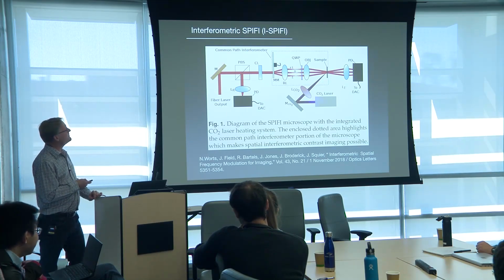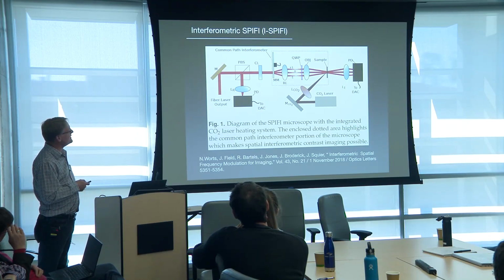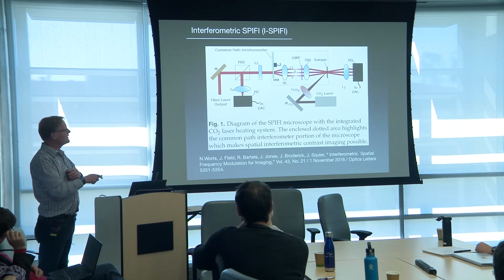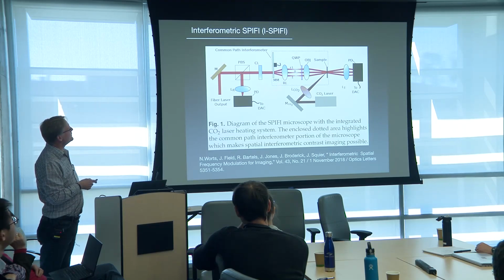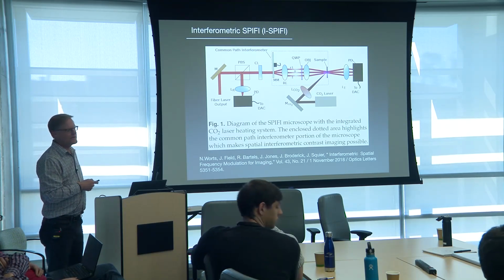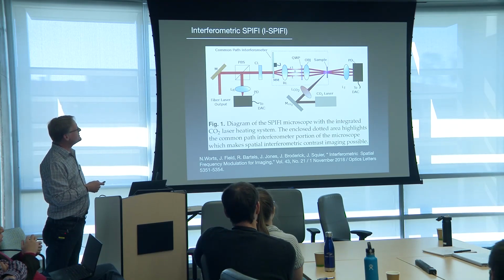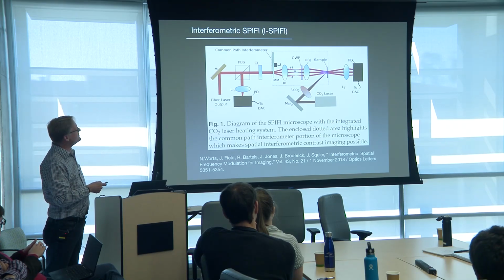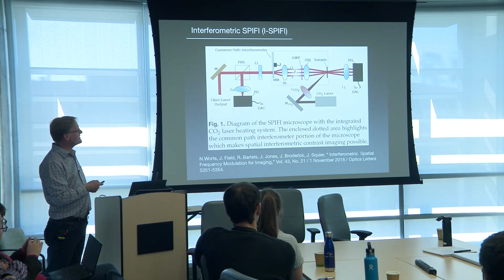Now, the other thing that we've done, what we had the realization is that if at any given instant you froze the mask, it became clear to me that, oh, wait a second, I've got an interferometer built into this system. So I've got a 0th order beam and a plus or minus 1 order system. And so what I want to do now is actually detect back through the mask on my point detector, and I can just collect it in front.